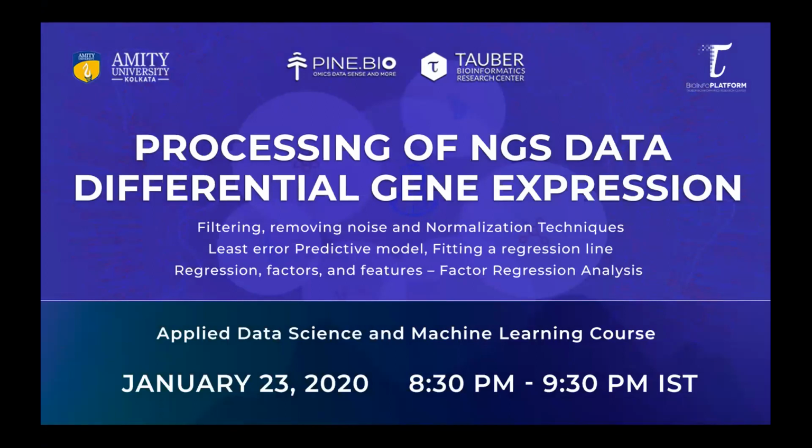Today we will continue to cover the approaches important for working with our table of expression, which we generated last time. So last time when we met, we talked about methods for data preparation for statistical analysis. We reviewed pre-processing, mapping, and quantification. Today, we will be learning about log normal transformation, quantile normalization, principal component analysis, as well as differential gene expression as the final step of the RNA-seq processing pipeline. We are also going to introduce student t-test.